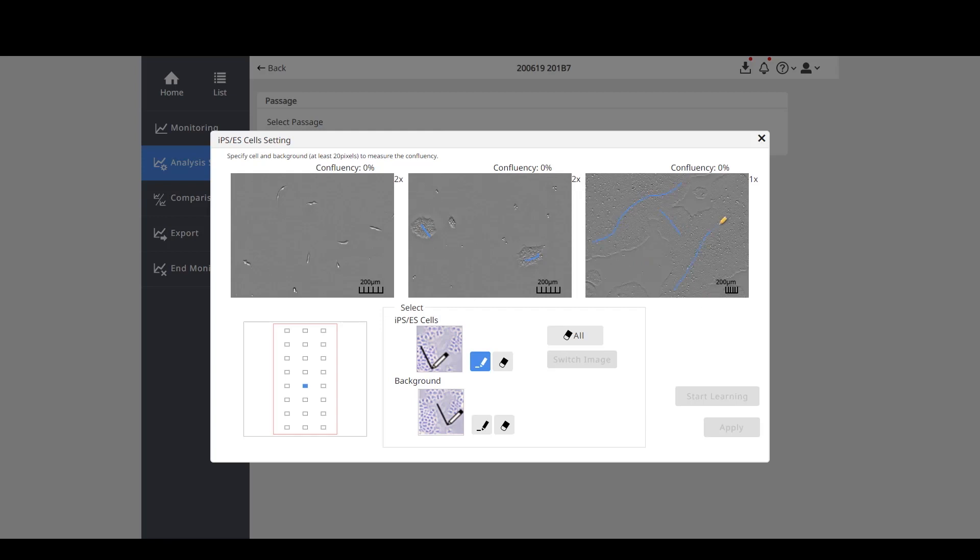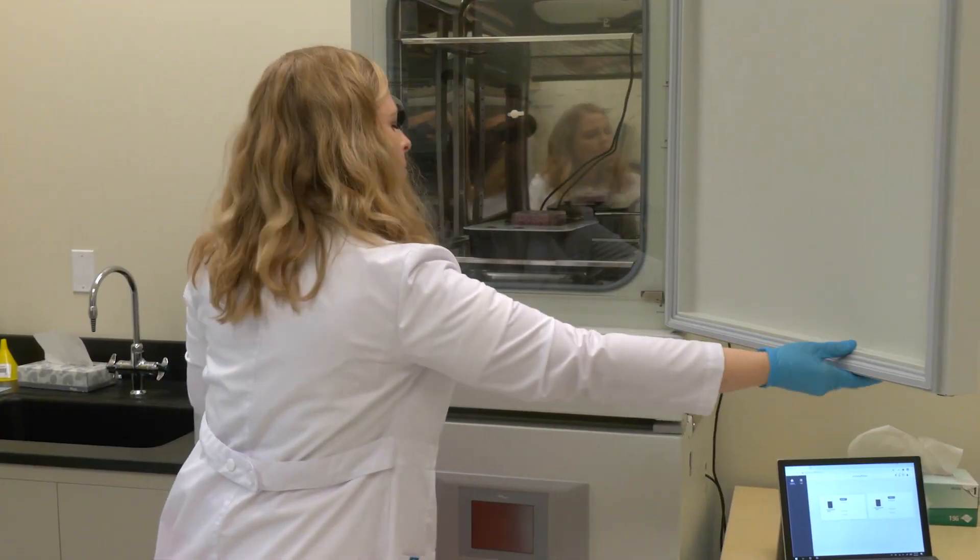And of course, the more you train, the more accurate your model becomes. The system is now ready to automatically analyze the cell cultures. Using these parameters, the system will count the number of cells and determine the confluency.